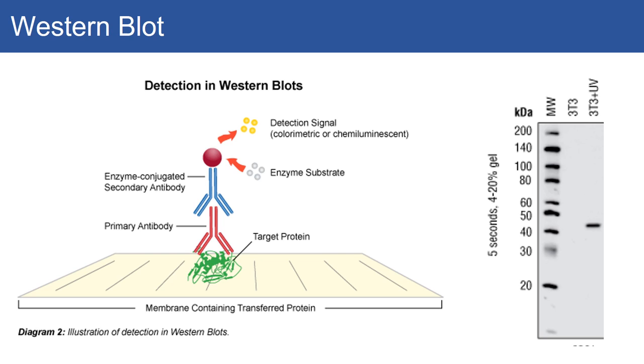And then off to the right is what you see. It's very, very clean because the antibodies generally are very specific. For the markers, generally we used to take the blots, and there was a dyed protein, and we could very easily just pencil in where the markers were, so we knew exactly where we were, and then there'd be a signal where the protein is, and it looks very clean based on that sample.